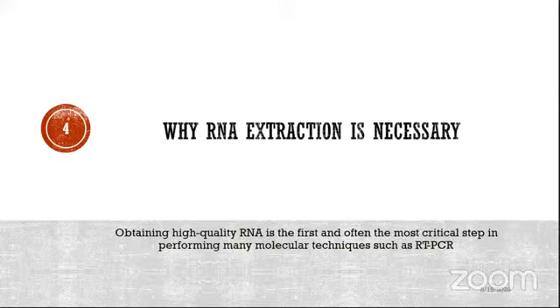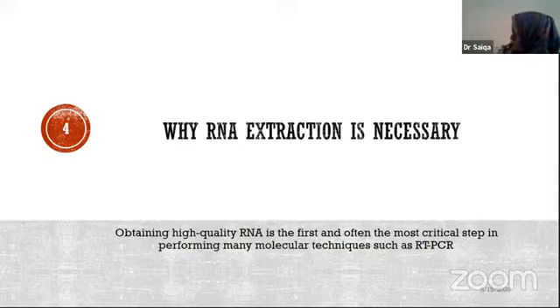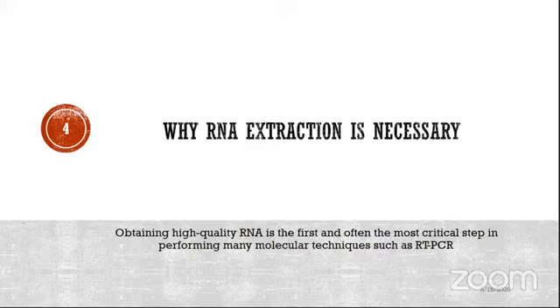So, the most important question: why is RNA extraction necessary? The simple answer is that we need to find the main gene of interest that is responsible for causing the disease, or the disease-related gene for diagnosis.